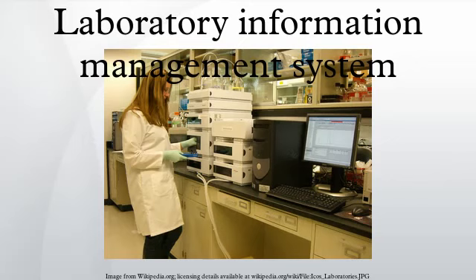as well as connecting each sample handling step with current instructions for performing the operation. Personnel and workload management: organize work schedules, workload assignments, employee demographic information, training, and financial information. Quality assurance and control: gauge and control sample quality, data entry standards, and workflow. Reports: create and schedule reports in a specific format.